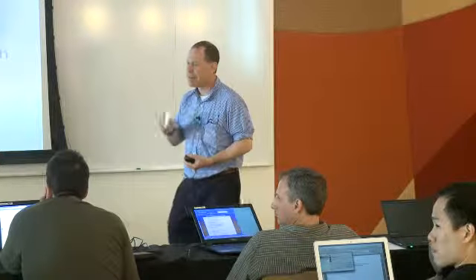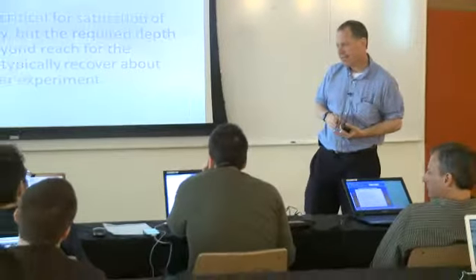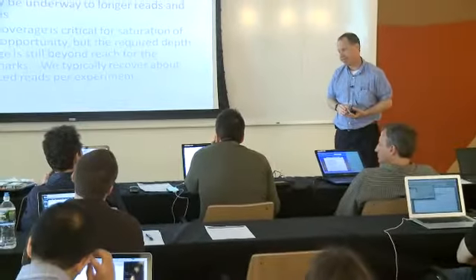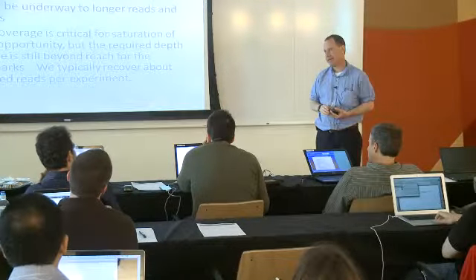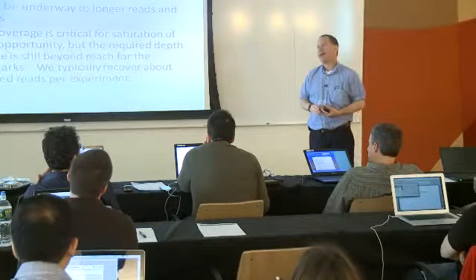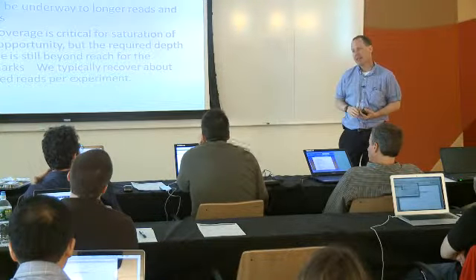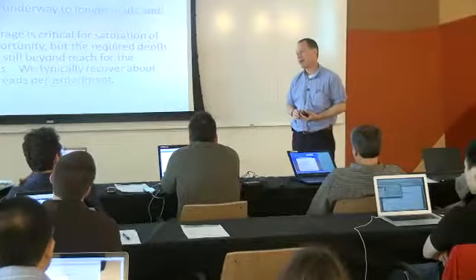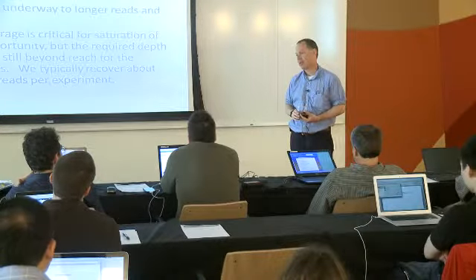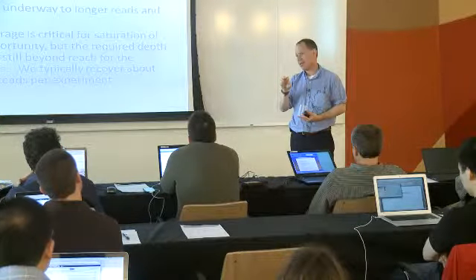Does that have any implications for locating the part of the DNA that's actually wrapping around the histone, or is that always identifiable? In mammalian studies, with the sequencing depths that we do, we tend to not have very precise information about how the DNA is situated on the histone.